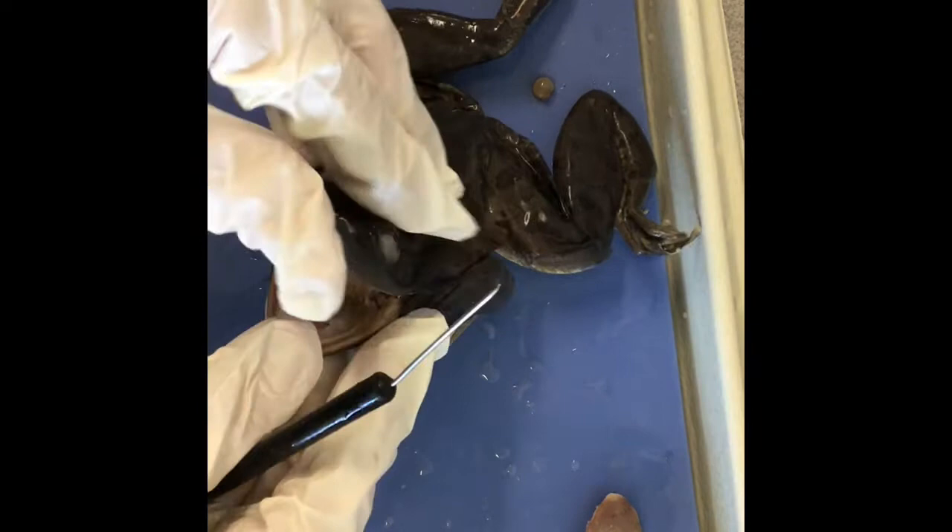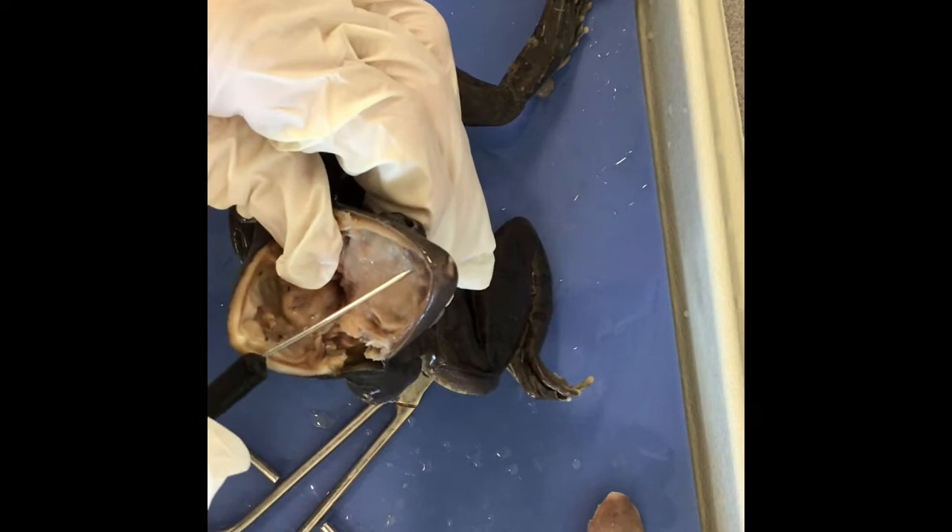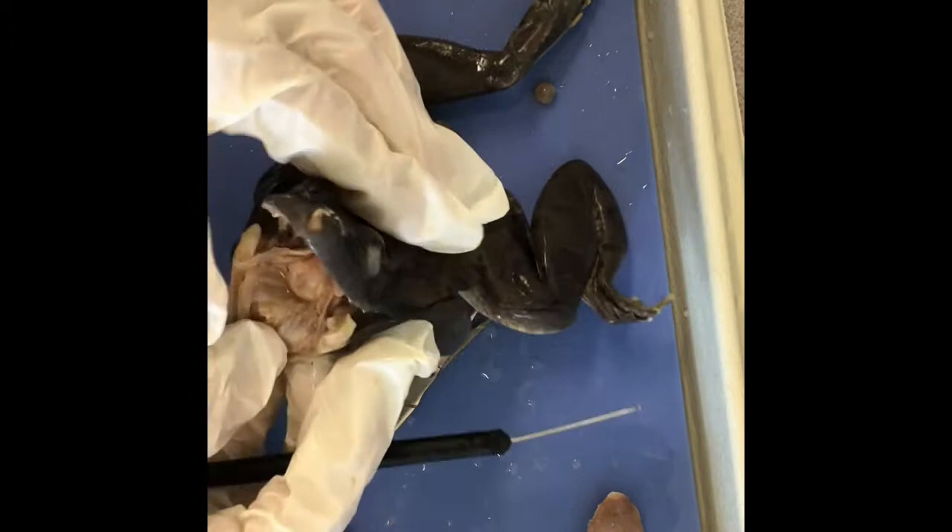The frog has two different types of teeth. The maxillary teeth are on the outside — I can feel them along the edge here. And then the inner teeth, the vomerine teeth, are two at the top, at the roof of its mouth. That's it for the inside of the mouth.